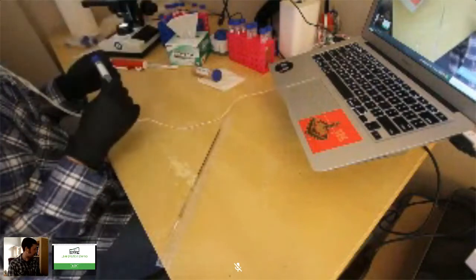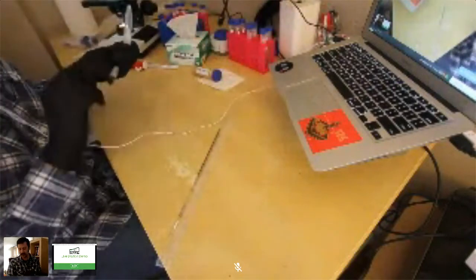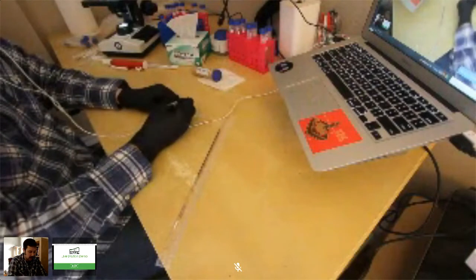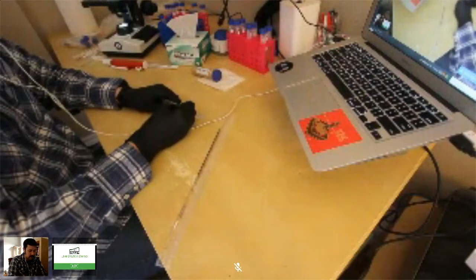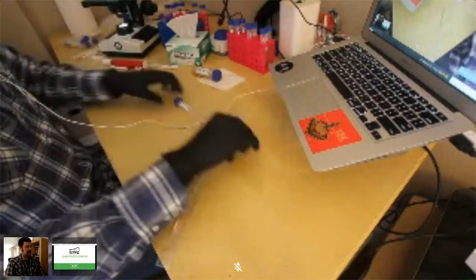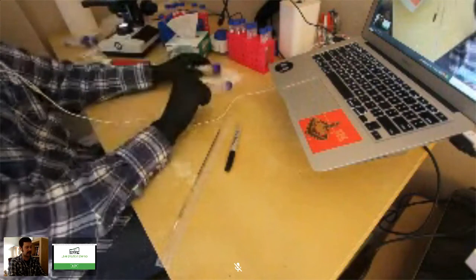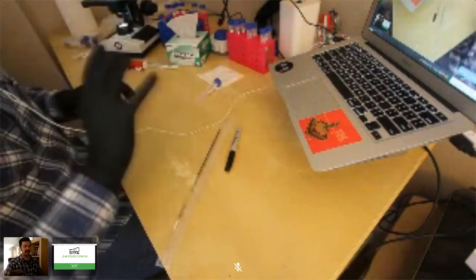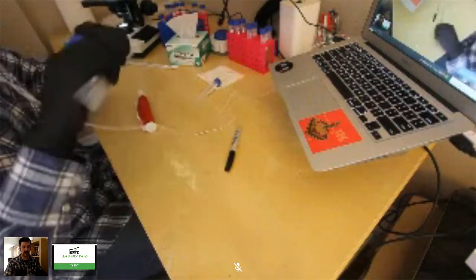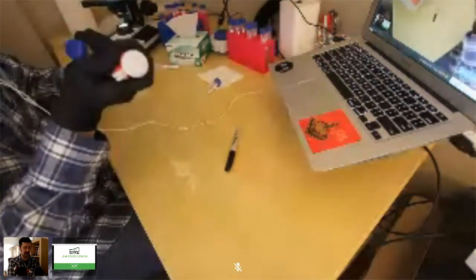I'm going to be doing a 1 in 100 or 1 in 10 dilution because I am working with equipment that doesn't allow me to do smaller dilutions. So I will write on it. It's always good to label your stuff, 1 in 10. So I've got my dilution tube that I'm going to be diluting into. You want to rouse your sample really well as you can. And then I'm going to take a clean pipette tip and pull that sample.